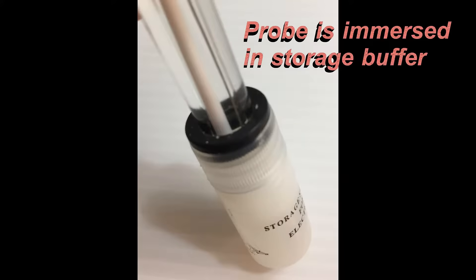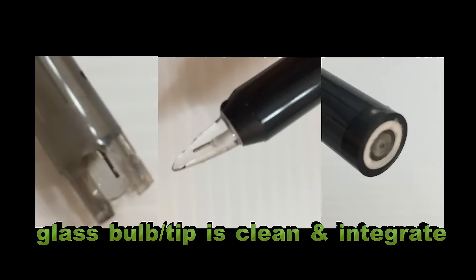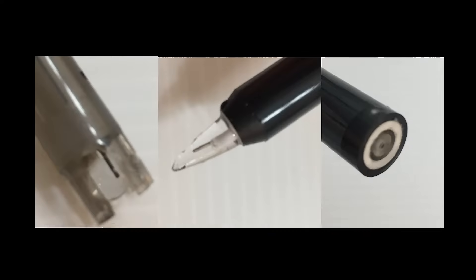Long PH electrode is immersed in storage buffer to avoid drying out. PH glass bulb and tip should be clean and integrate.